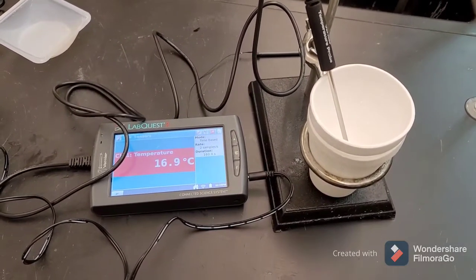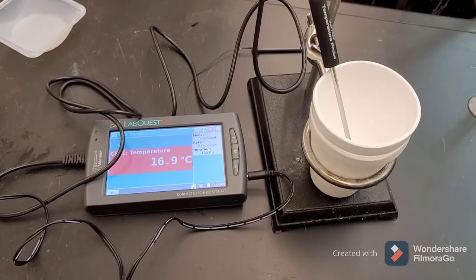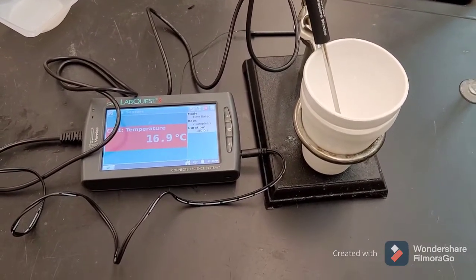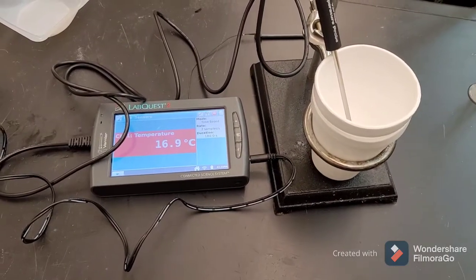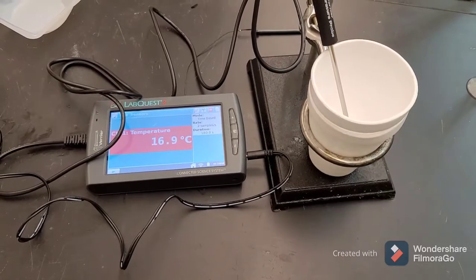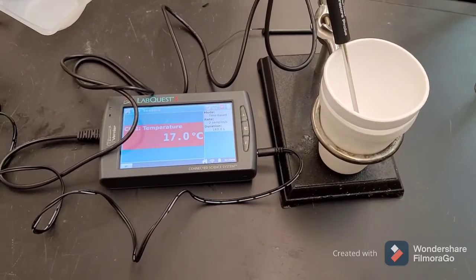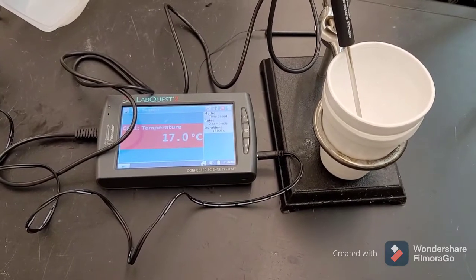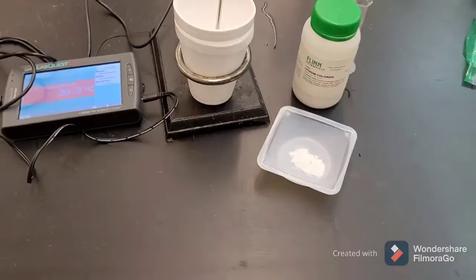So we can see that when potassium chloride dissolves in water, the temperature goes down. Okay, so it's getting colder. If I was touching it, it would feel cold. And if you read your lab, you should know what that means. So it looks like our coldest temperature for this is going to be 16.9.